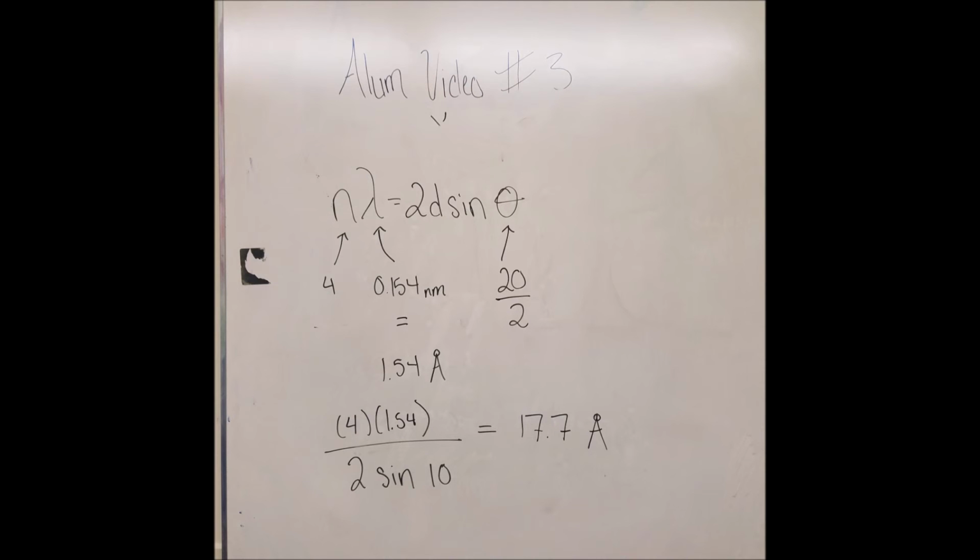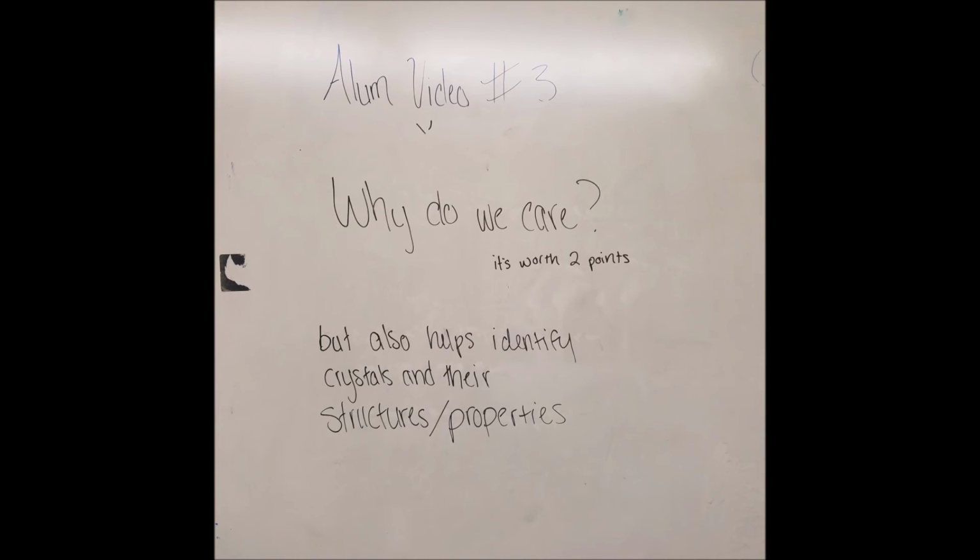Now for an overview of this video, we now know the D-spacing of our alum crystal. D-spacing is important because it's part of X-ray diffraction, which allows us to determine the properties and identity of certain crystals, which can be used in many different applications.